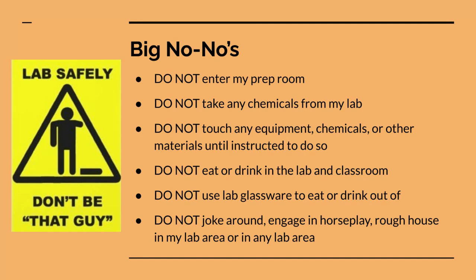Okay. Do not eat or drink in the lab or the classroom. That's just my general rule in this room. You don't get to eat in here. I get to eat in here. You don't. Okay. Do not use lab glassware to eat or drink out of. This is pretty much, again, self-explanatory. And please, if you really want to joke about, oh, I'm going to put water in here and can I drink it?